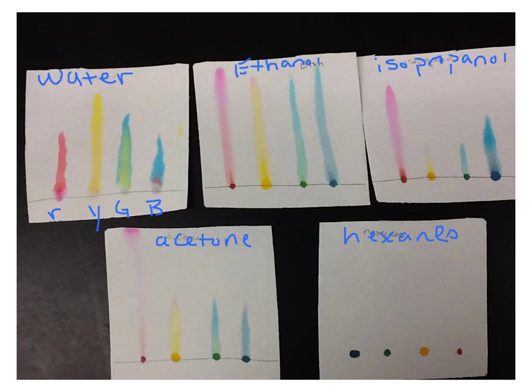So in most of these, we're looking for a separation of colors. So you can see with the water sample, and I let these run a little bit too long, like with this ethanol here, you shouldn't see it up here this high. So I didn't watch it very well, especially over here with this acetone. You shouldn't see it up that high. Remember, it should be about within an inch below the top of the paper.